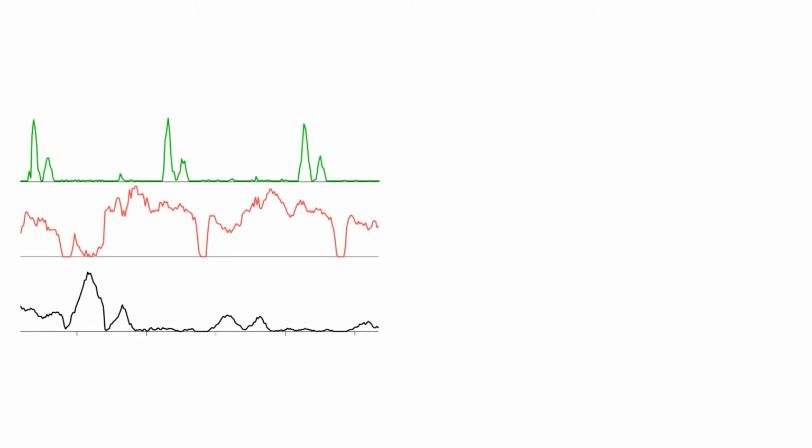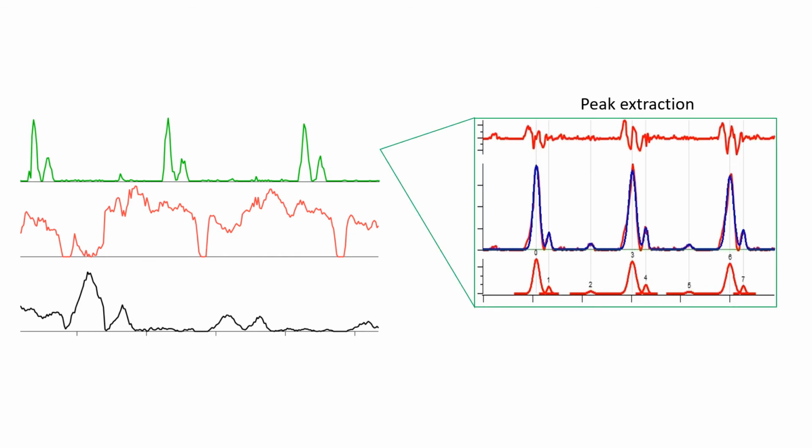The extraction is done by fitting all the peaks found in each factor, and we found a total of 8 peaks from factor 1 in this example.